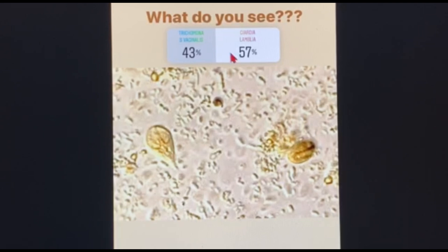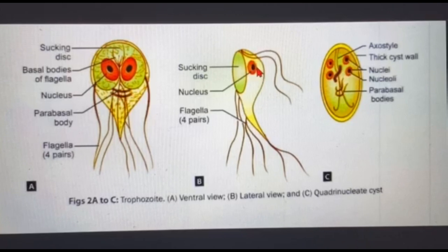Now before that, let me run through the morphological theoretical picture. So if you see here, this is the trophozoite form and this is the cyst form of Giardia. There are two forms. The trophozoite is the one which is actually the racket-shaped or heart-shaped as the textbook describes it.